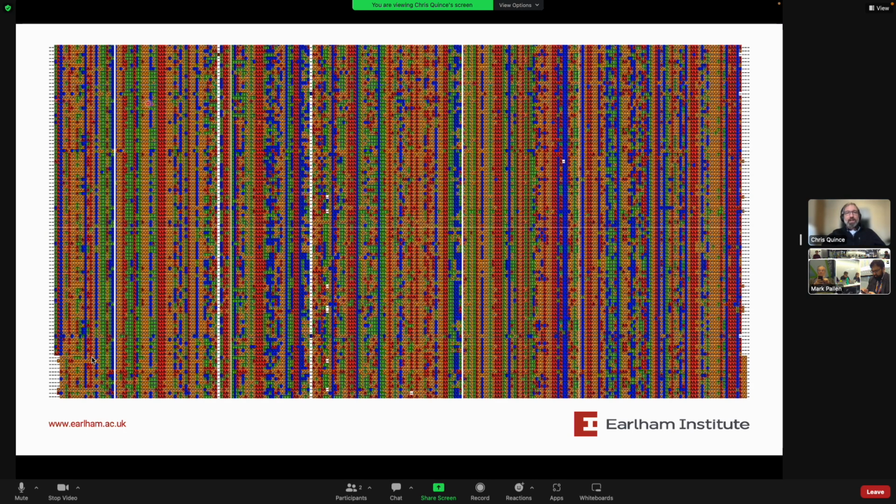So anyway, this is a load of 16S sequences. These are forward and reverse reads of 250 base pairs on the V4 region. The conserved primer for the forward reads is starting over here, and then I've got a few of the reverse reads where the primer is starting over there. But these reads almost entirely overlap. If you do a longer region, your forward and reverse reads won't entirely overlap. They'll perhaps just overlap over in the middle portion, but you do want to get some overlap.